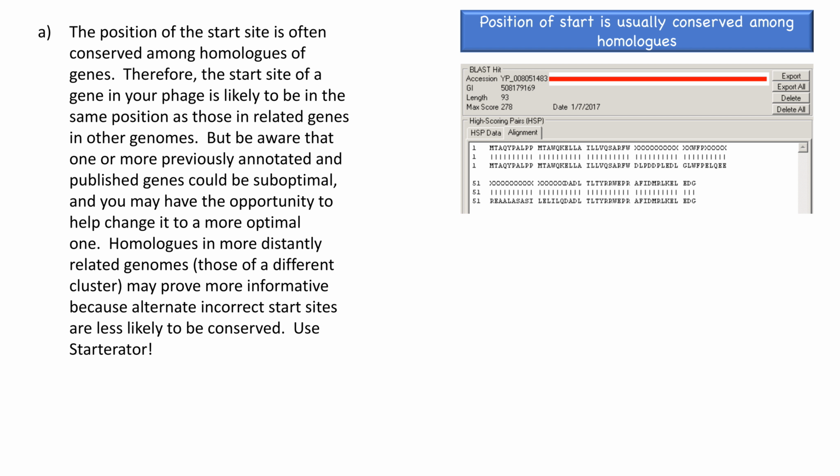protein sequence, which is the amino acid sequence of the protein in our genome sequence that we're analyzing, does it match the same for the first amino acid of the target sequence? So whatever it matches up with in PhagesDB or NCBI, do they start in the exact same place?